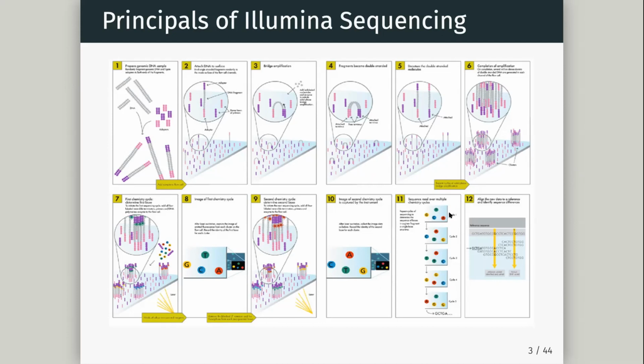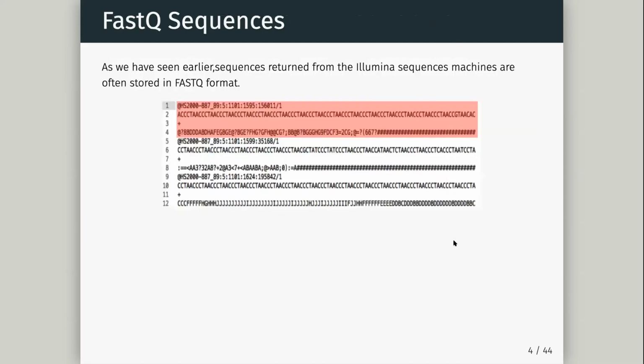So if this red, we weren't quite sure if it's really red, maybe it's a little greenish. That quality score, the quality scores we see here, that's what that is based on. Okay. How well we can really recognize the color for that particular cluster.